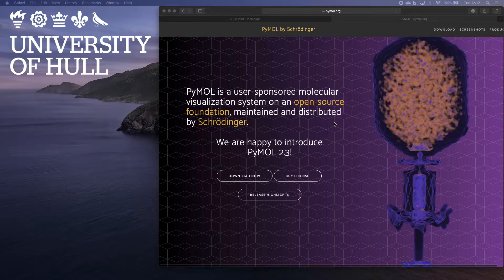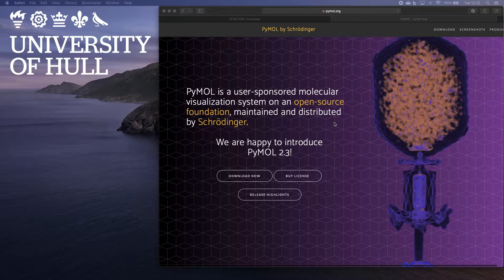Fabulous piece of software that you can use for manipulating structures, looking at structures, making fabulous images of them.